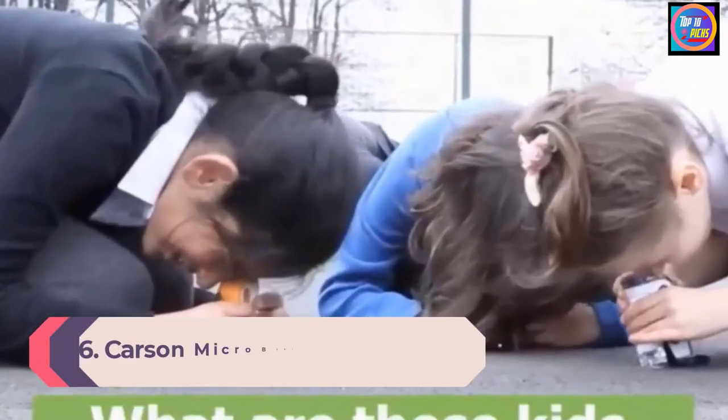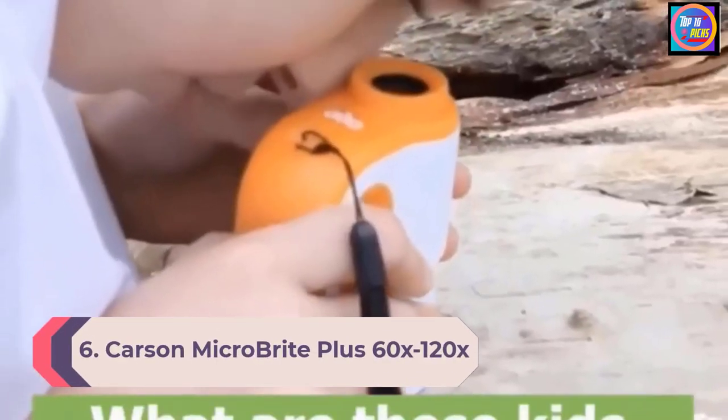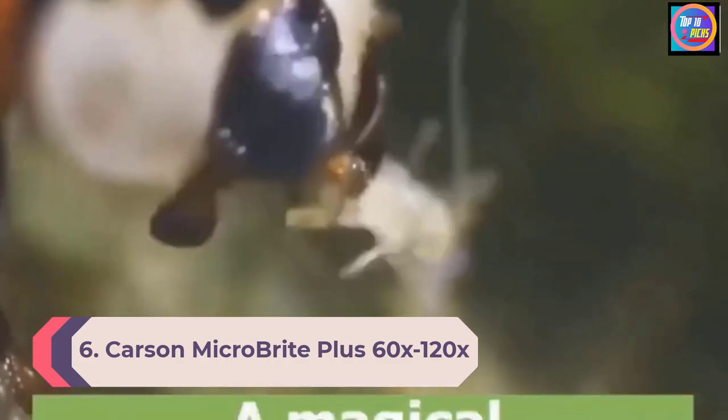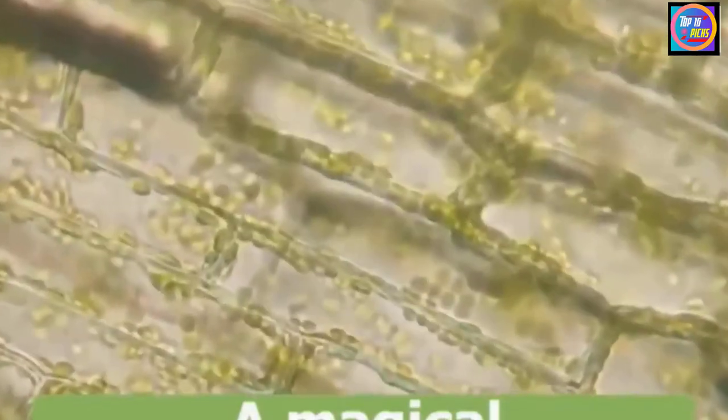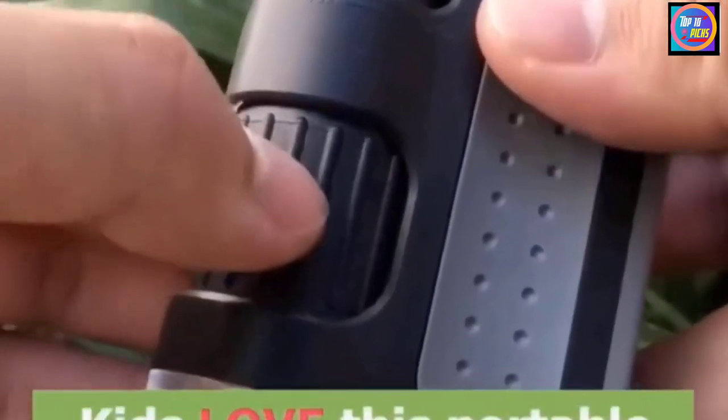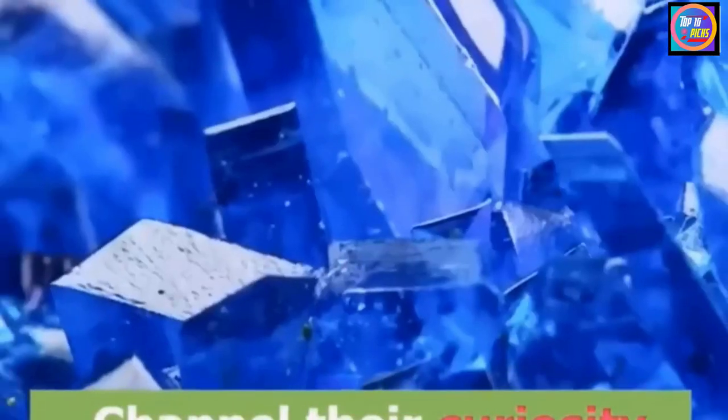Number 6. Carson Microbrite Plus 60x 120x LED Microscope. Carson designed this microscope with two objectives of 60x and 120x, allowing you to see more than 2mm of an object, which is ideal for exploring plants in great detail.